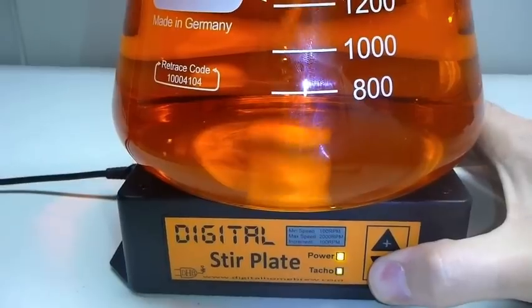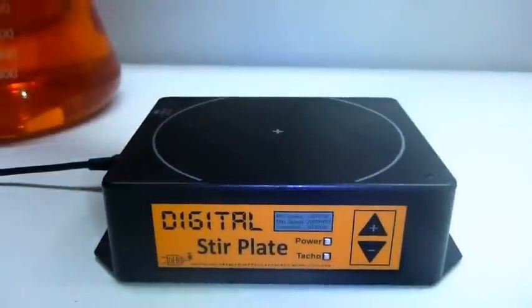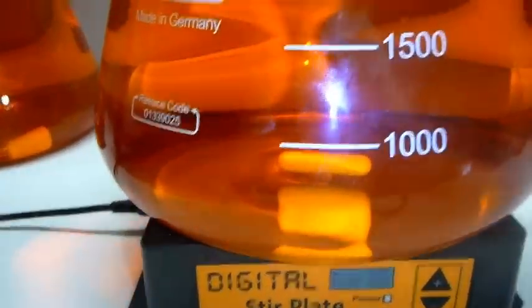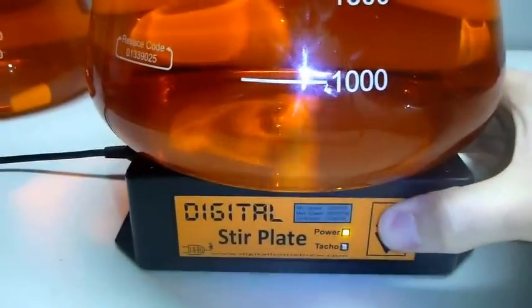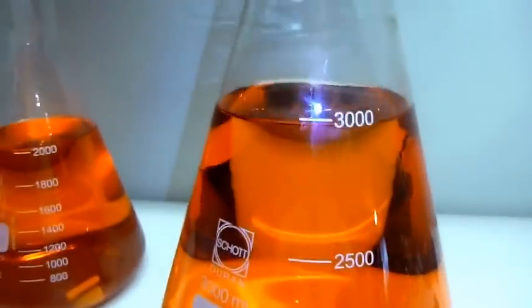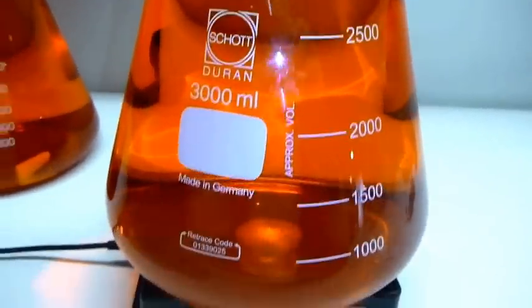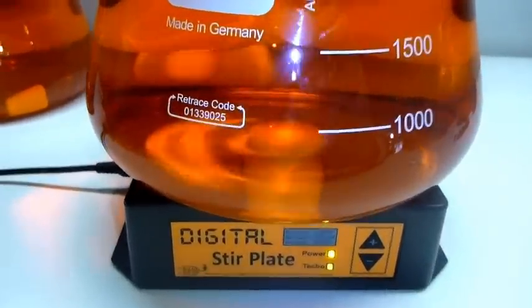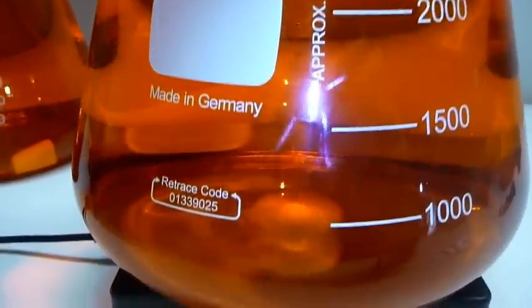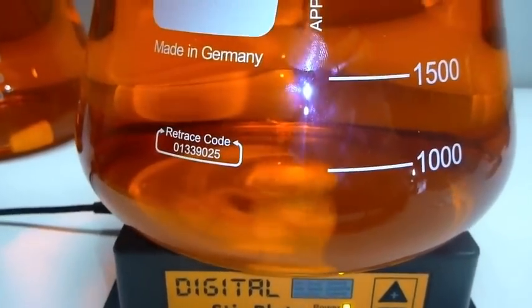Now the 3-litre flask next — same bar again, this is still the 30x7mm stir bar that we'll be shipping with all of these stir plates. These are all shot during glassware. This will take a bit longer because it's a larger body of water to get the stirring going, but there you go — again it's reaching the bottom and sucking in some air.